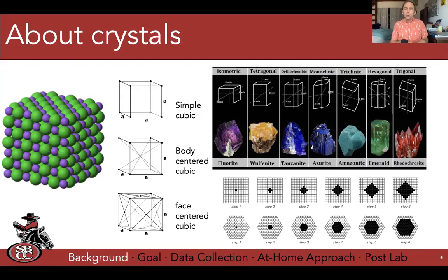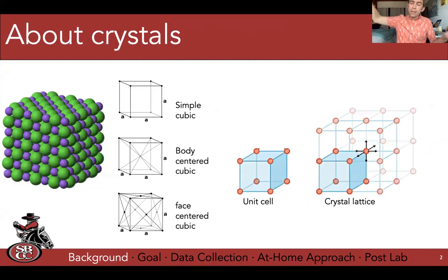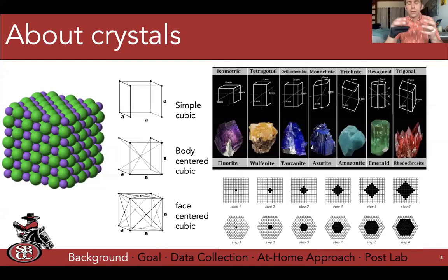So when you grow a crystal, one thing that's important to know is it has to start somewhere, or nucleate. So a crystal is a very ordered growth of this system, of these cubic unit cells that are then brought out onto the macro scale. And so they have to start someplace. So there are different ways that you can nucleate. We often use a seed crystal, so a very, very small crystal, and then that's where our crystal can grow from. So every crystal is going to need a nucleation site.